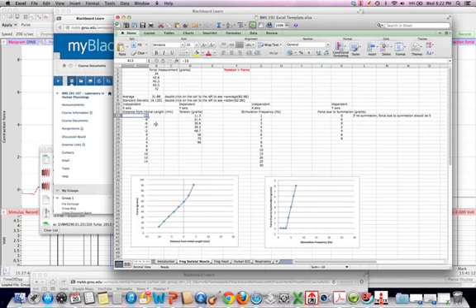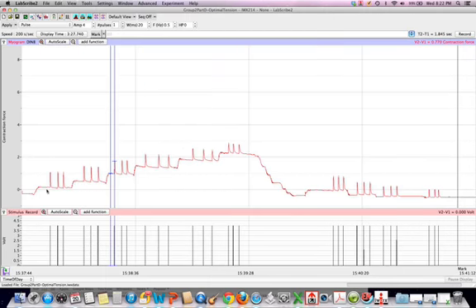What we're doing here is that we have a couple of things to work with. This is talking about distance from the initial length in millimeters. So the 0 point, in this case, right here, corresponds to where we started off, which is this one right here. That's our 0 point. Plus 1 is here, plus 2, plus 3, plus 4, plus 5. This is minus 1, minus 2, minus 3, minus 4.